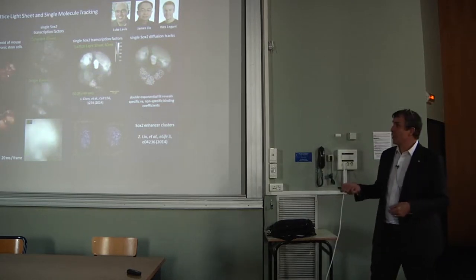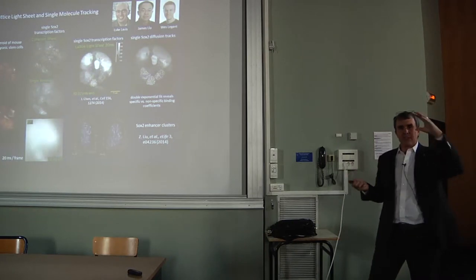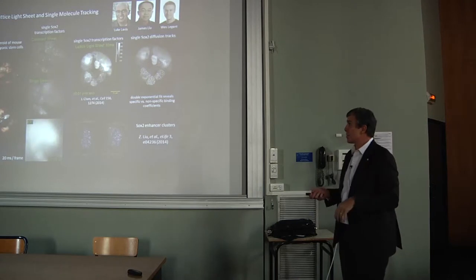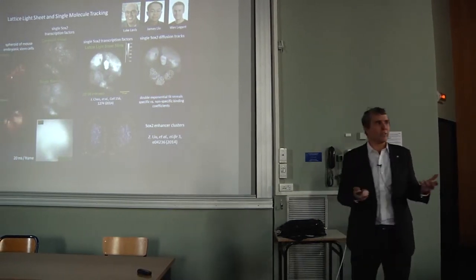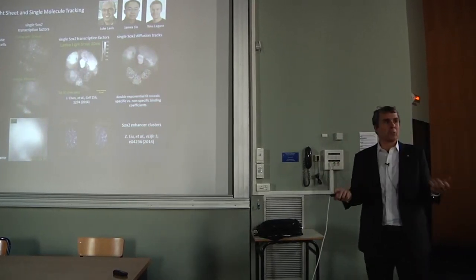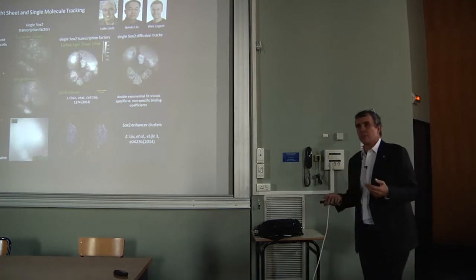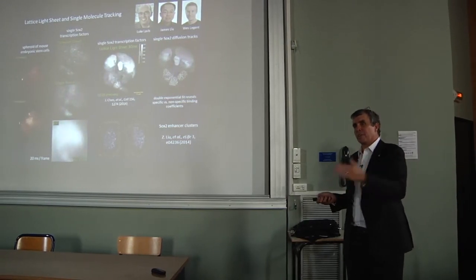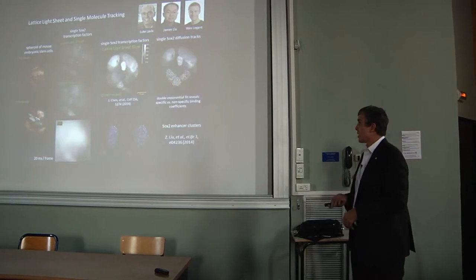It's just a haze. But if you take a light sheet that we can create that's thinner than the depth of focus of our detection objective, and you park that at one plane, then only molecules that are in focus get illuminated. And then you get very high signal to noise to be able to see those molecules. In a couple of studies, we used this to study the transient kinetics of the binding of transcription factors, both specific and nonspecific, to DNA.